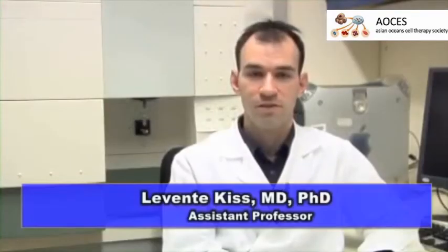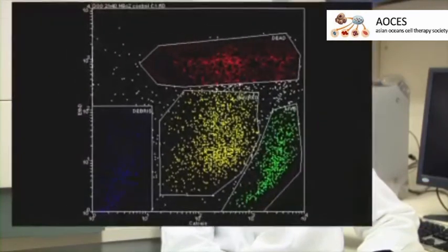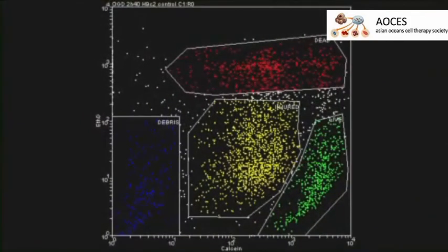We found that the addition of healthy stem cells increased the ratio of surviving cells in the population. Interestingly, we also observed that the cells which were saved after the injury can be gated out from those which were dead, but also from those that remained alive. We believe that this population warrants further investigation.